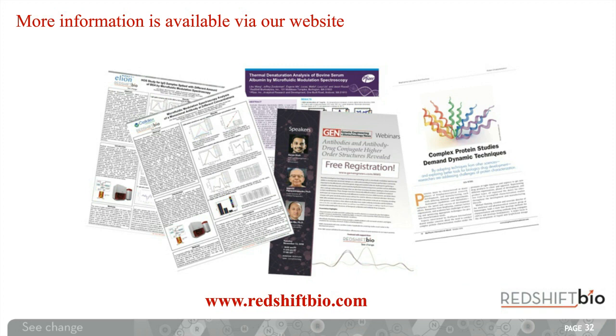Thank you, Melissa. Yes, very good question. Yes, we can. We can actually measure several parameters that can give us some information about aggregation processes that might be occurring. You can use the quantitation part of the measurement to first of all know whether or not the concentration of your samples is decreasing between replicates. We sample in the wells from the bottom, so if we see some variation between subsequent replicates, that can tell us that some aggregation has occurred or is occurring during the time course of the measurement.